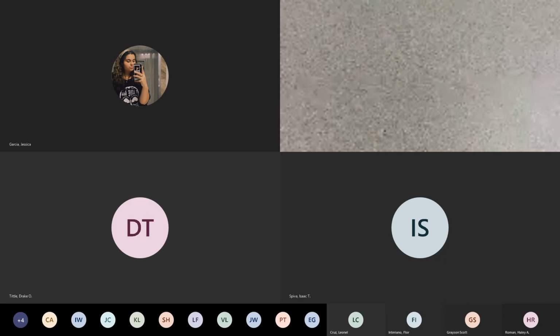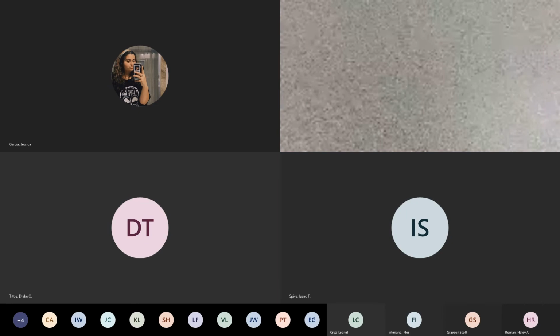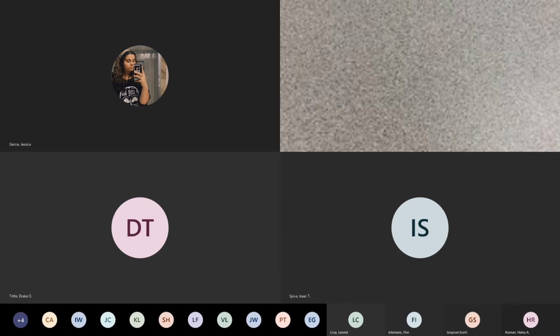So let me tell you one thing that I found out about filming with this tablet today. If I'm filming a video, then I can zoom in to really great detail. But if I'm filming a Teams meeting, I am not able to zoom in as far. I'm kind of stuck with what they give me. So what I did was, we're going to be testing 6 samples today, and I went ahead and recorded close-ups of those 6, and I posted them in the lab module 1. So it's a little 1-minute video of our 6 samples, just in case you want to see them slightly more close up than the ones we're going to be doing here.